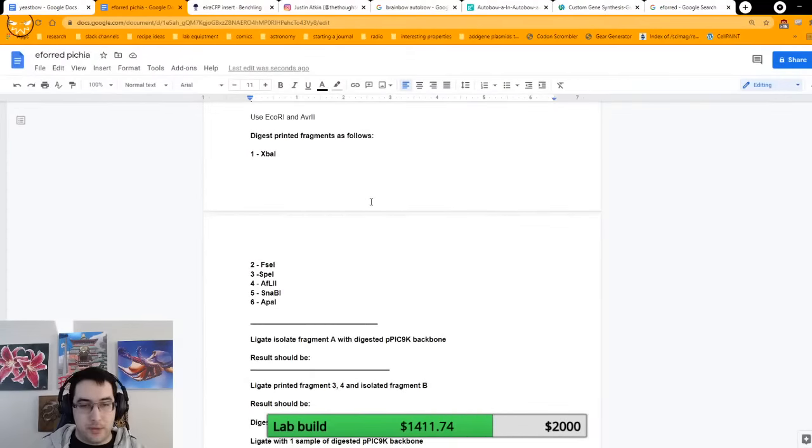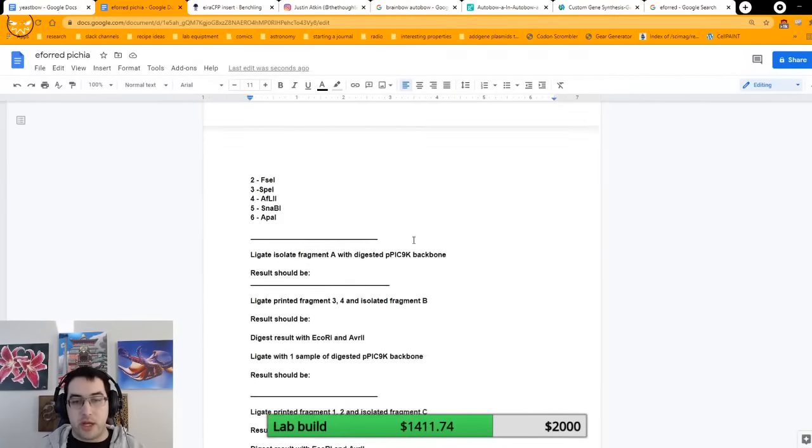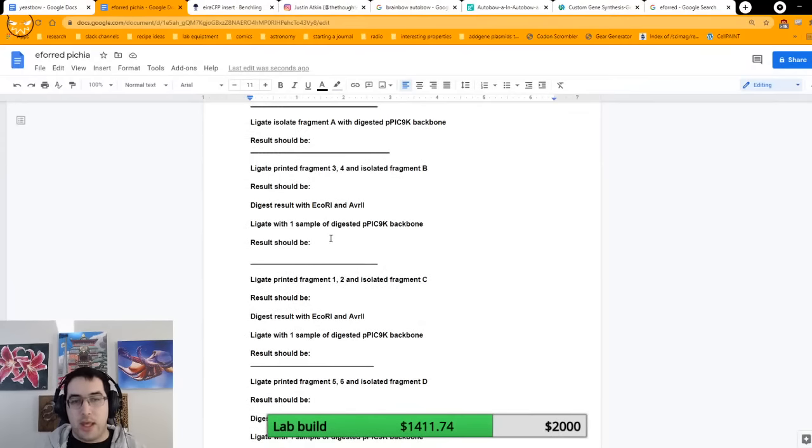Okay. Cool. So this is where things get very, very messy. This is why I saved this step for the very end, where all the results should be. It's just pasting in huge chunks of code. I always save this for the end because as soon as you do this, it makes scrolling through this a nightmare, especially on a file like this, where I'm essentially asking them to make me 4 different plasmids in one file. I've never asked them to do something this complicated before. So I don't know if they're even going to accept it, but if I write everything out really neatly, it should be fine.